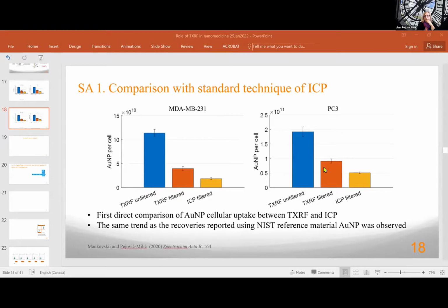And we dug into that a little bit deeper. There is no paper where they describe in detail sample prep and ICP measurement. So each group does it in a slightly different way. And there was never a chemist with ICP expertise who spent time to develop this properly and standardize it for them. Does that answer the question? Follow-up comment: wouldn't that depend on the particle size and also syringe filter pore size? Yes, I expect so. Again, I never spent time nor do I plan to fix the ICP issue. That's not my interest. But I would suspect, yes, for sure, both would affect how much sample is lost in this sample prep method. Okay, I think that now answers the question.